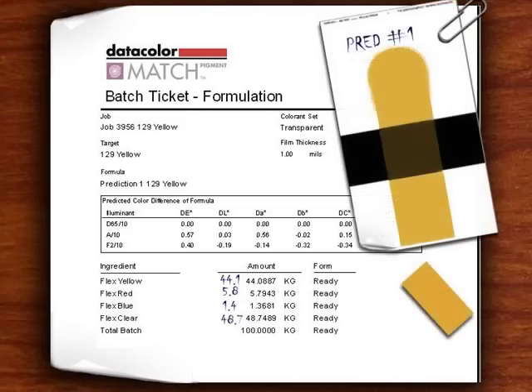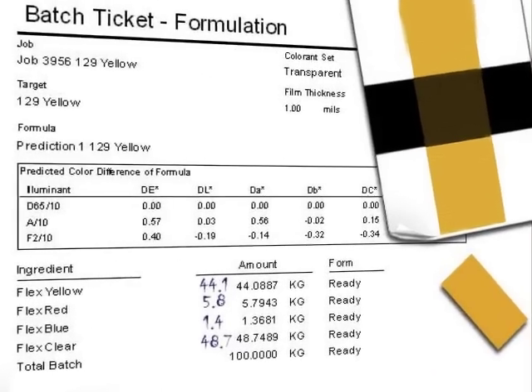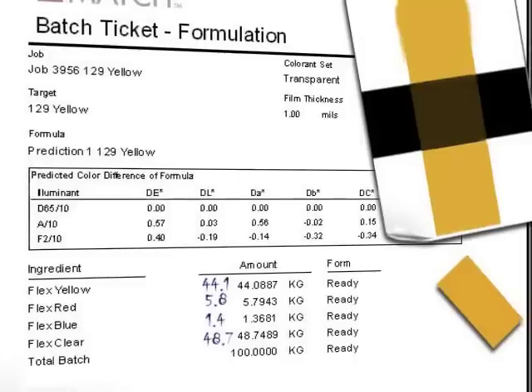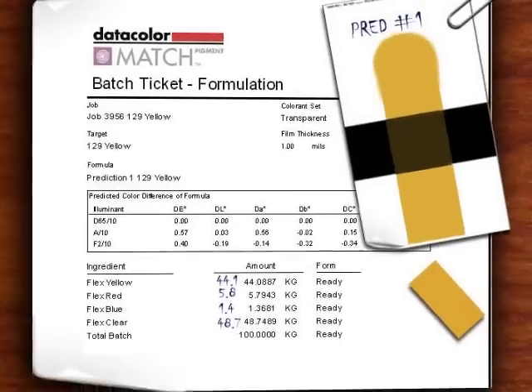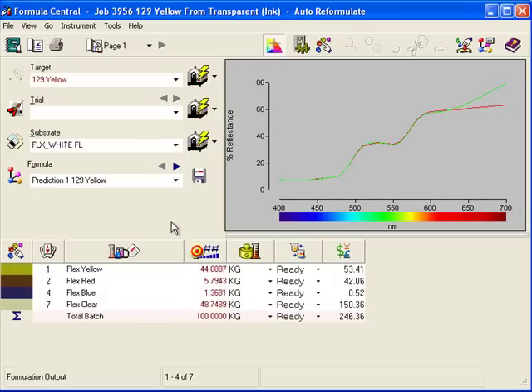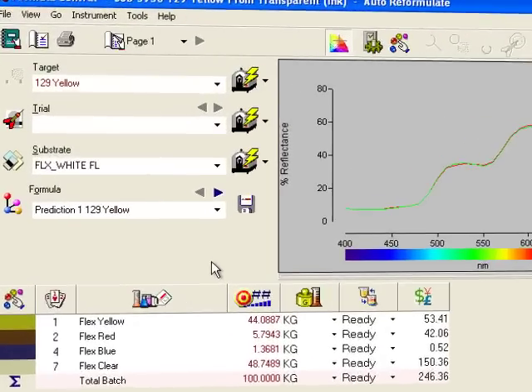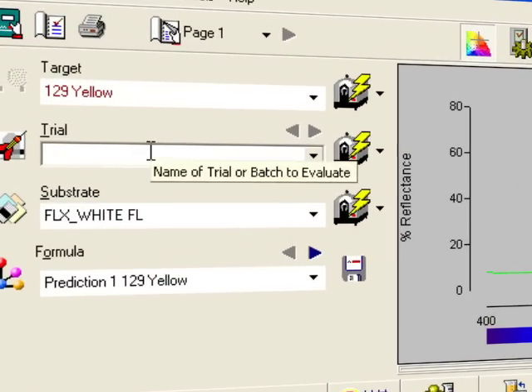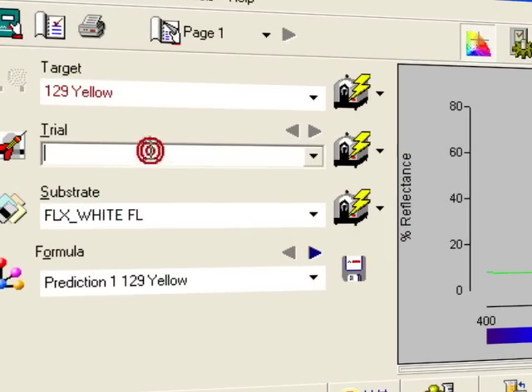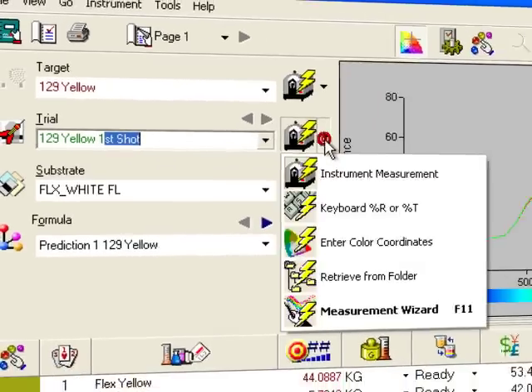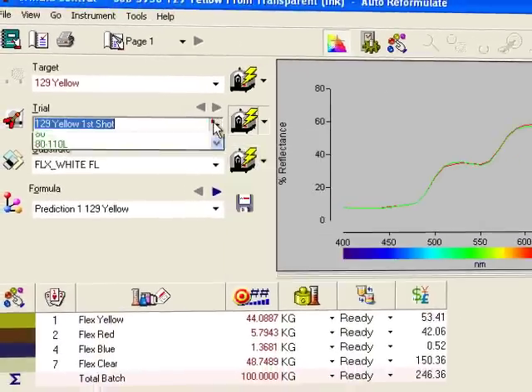Having made a sample of the prediction, I can use Formula Central to compare it to the target and refine the color match if it needs it. To start the process, just measure the trial sample. Type a name here, then use the measurement button or the drop-down to select a stored sample.